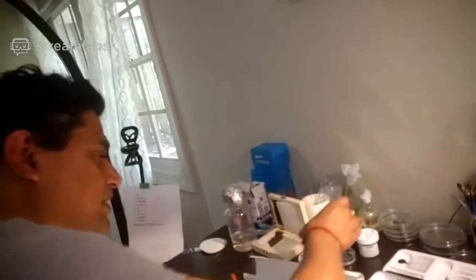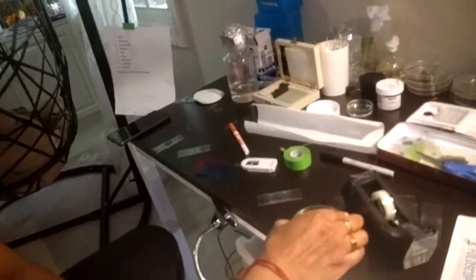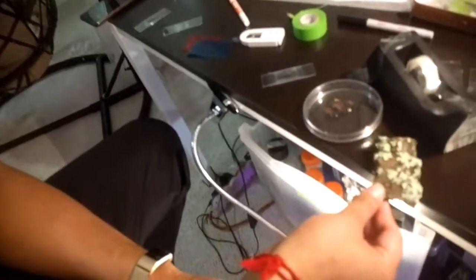Now, the thing about lichens, look, here are all my lichen samples. Here's a lichen sample that I just got from outside. These undergo drying and wetting cycles constantly. So anything that grows on them is adapted to these drying and wetting cycles.